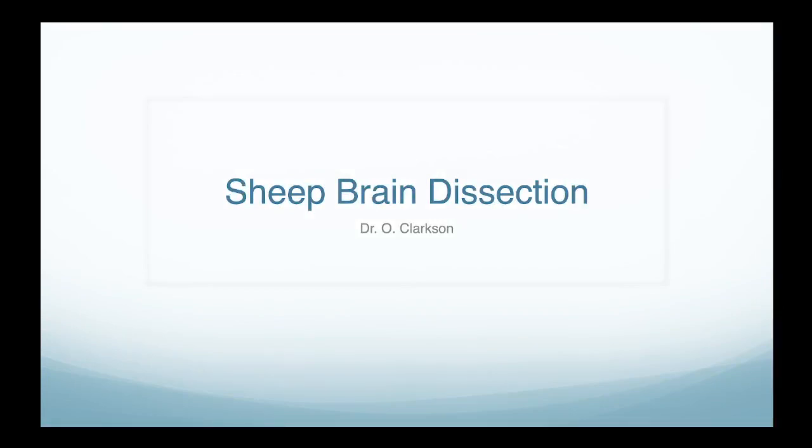For this lecture, we're going to be talking about the sheep brain dissection and also just basic components of neuroanatomy that you should be familiar with for the purposes of medical physiology.